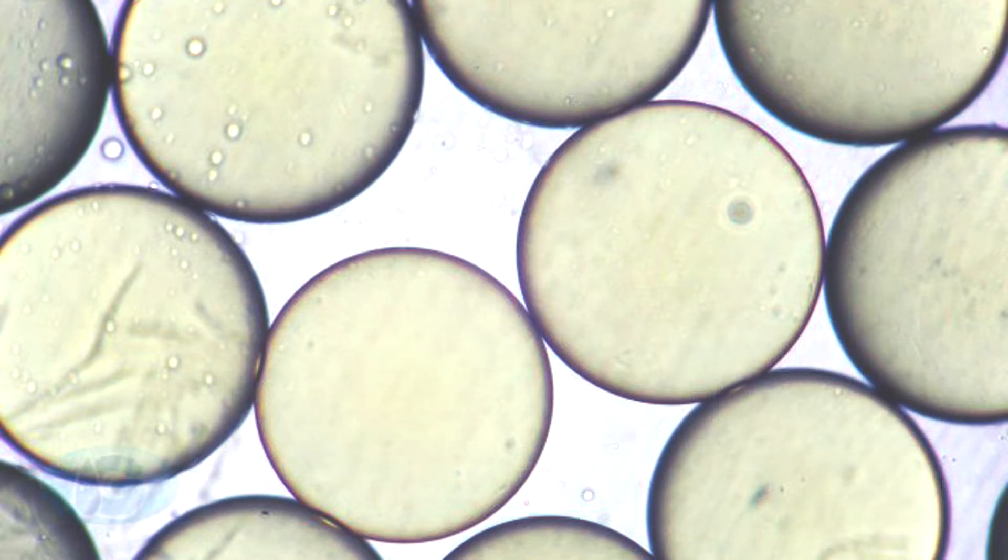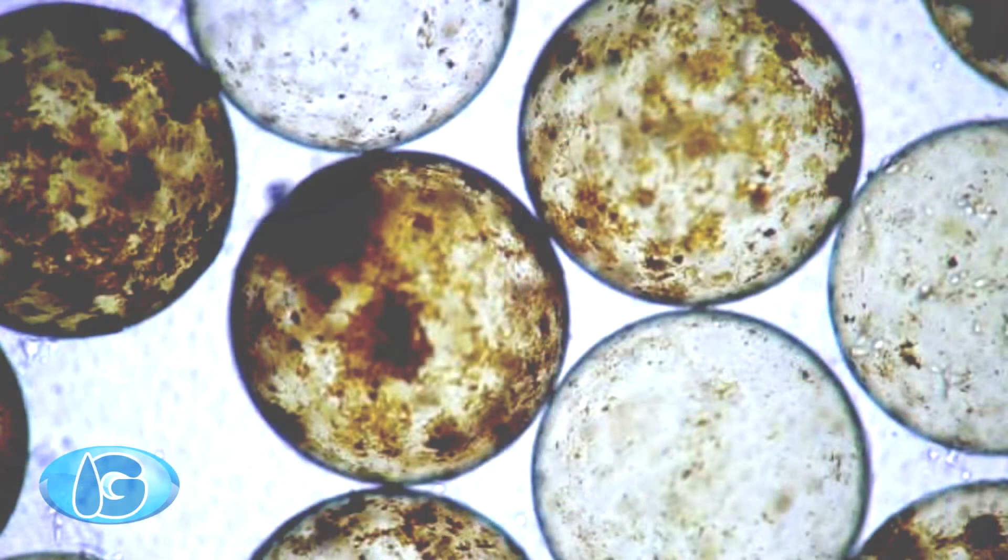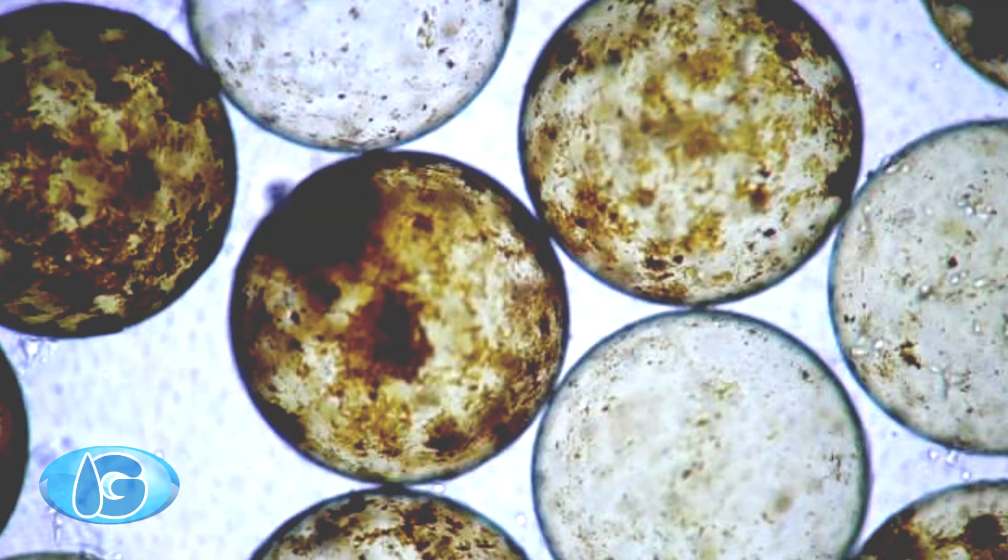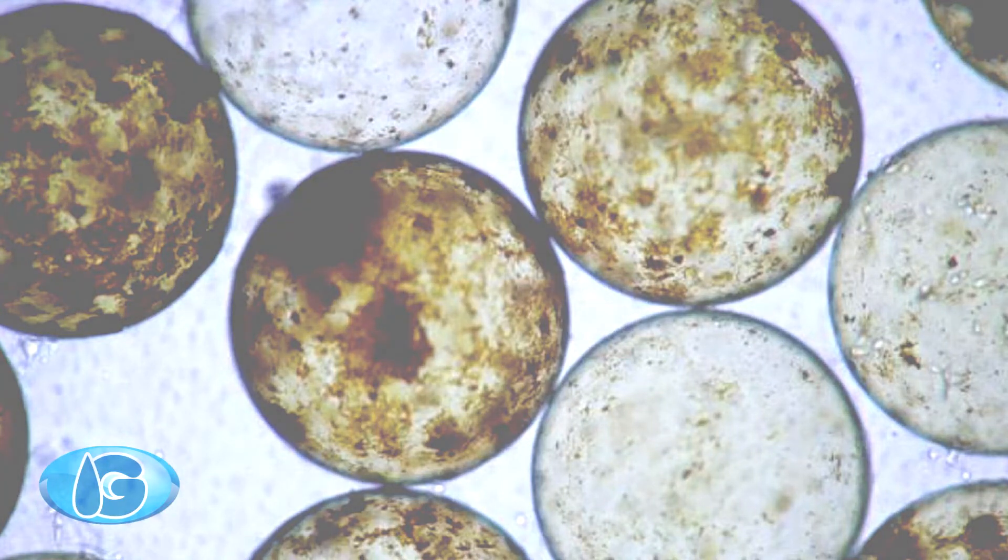Hello technicians and engineers, we are talking in this video about microscopy of ion exchange resins. The purpose of this study is to show how resins is mainly in morphology, size and what happened after use.